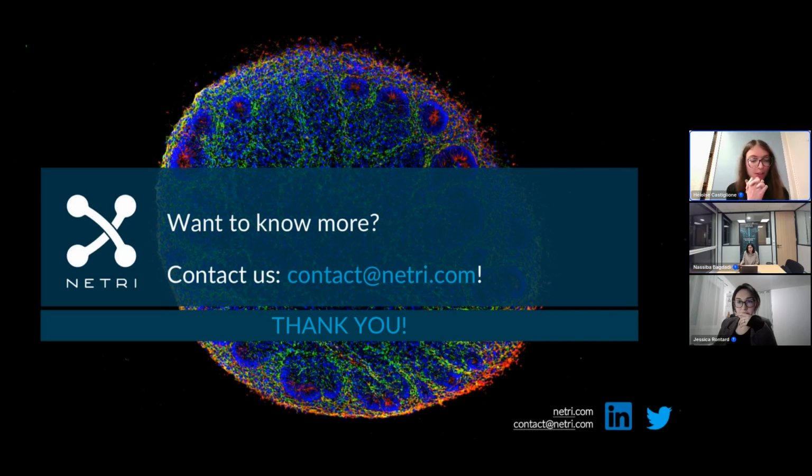Yes, maybe I can answer. I think it would be completely possible with the duplex architecture, with the 2 compartments, to have the tumor invasion in the bottom channel on the membrane if the organoid above in the culture chamber adheres onto the membrane and there is kind of direct contact.